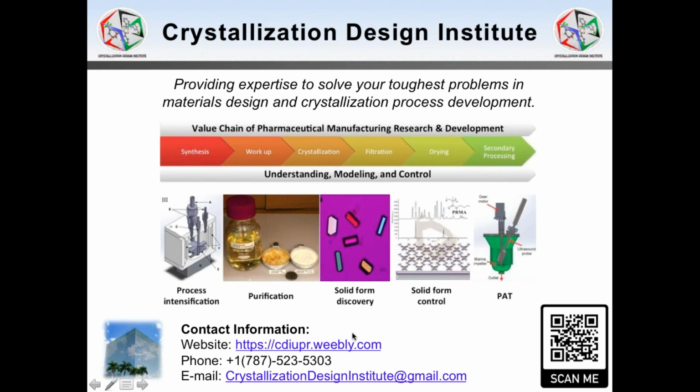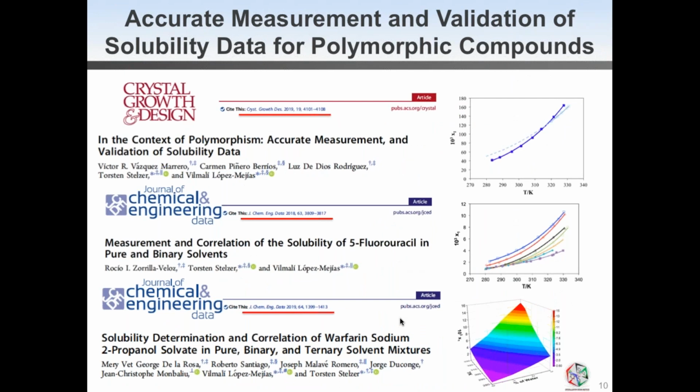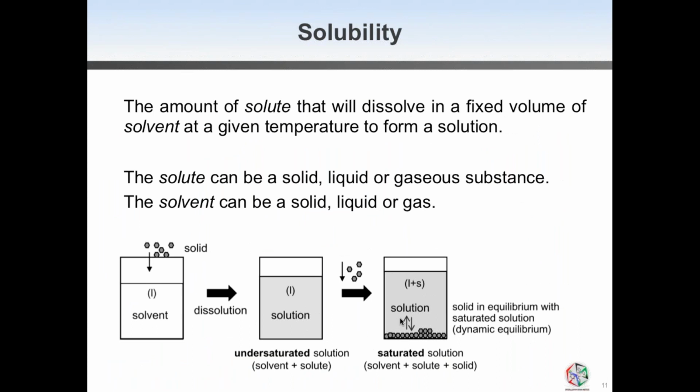So in the past roughly 5 years since we started with the Crystallization Design Institute at the University of Puerto Rico, we have spent quite some time on the challenging task of measuring the solubility of polymorphic compounds. Today we would like to share with you our experience and provide some insights on how we believe we can ensure accurate measurement of solubility of such polymorphic compounds. However, before we can really dive into the science, we need to make sure that we are all on the same page in terms of terminology.